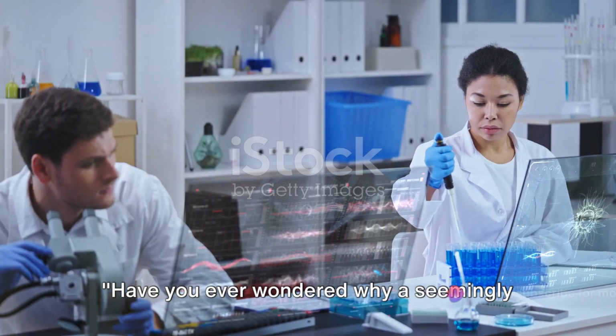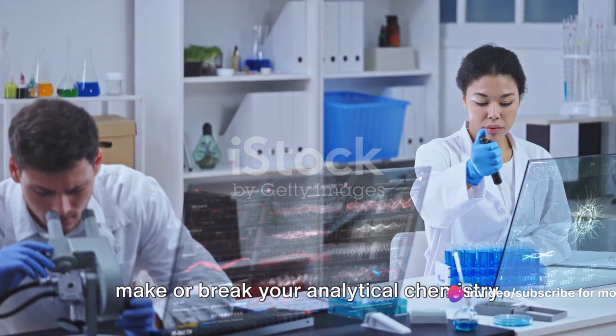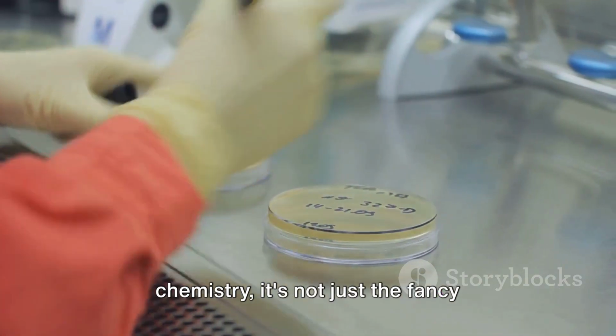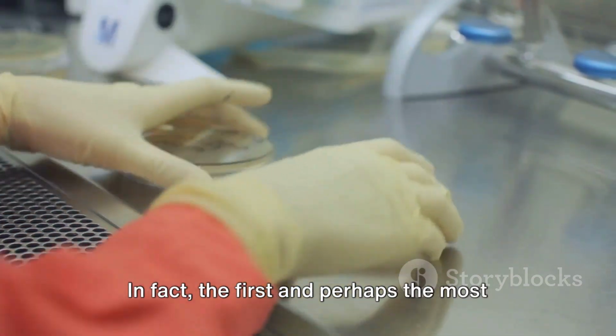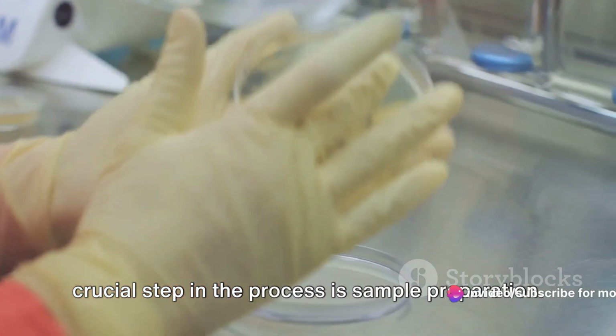Have you ever wondered why a seemingly simple step like sample preparation can make or break your analytical chemistry results? When it comes to analytical chemistry, it's not just the fancy instruments or the complex formulas that matter. In fact, the first and perhaps the most crucial step in the process is sample preparation.